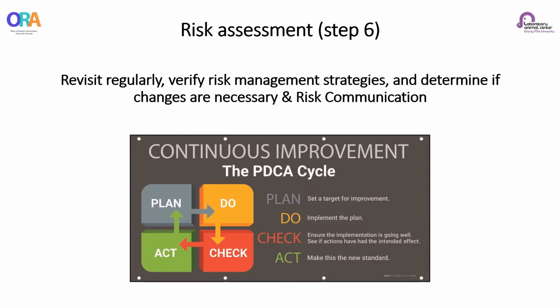The principal investigator or facility equivalent has a primary responsibility for communicating hazards and risks in the laboratory. Staff must have the ability to report issues, including incidents and near misses, without fear of reprisal.